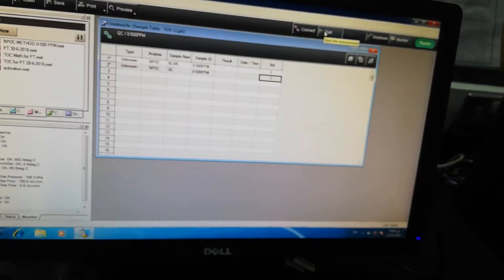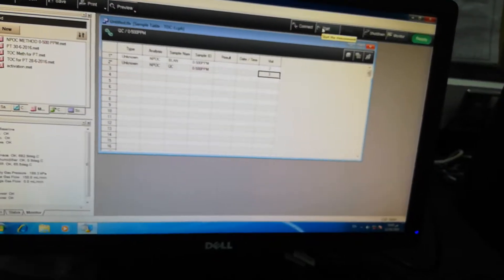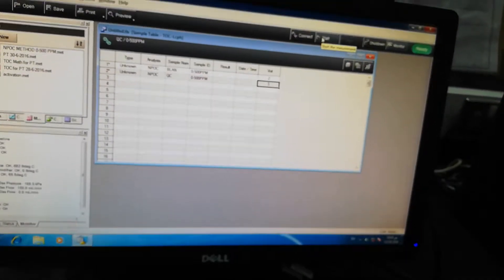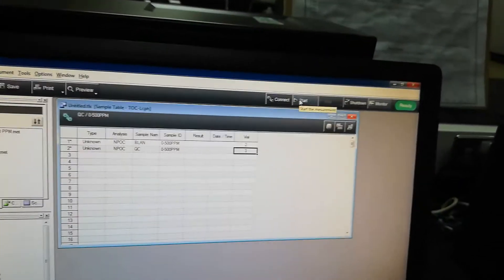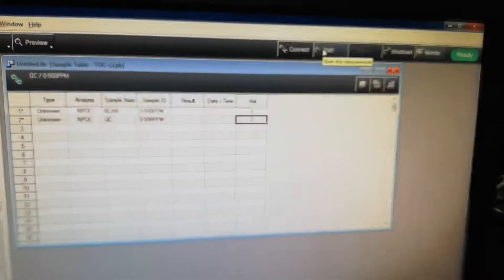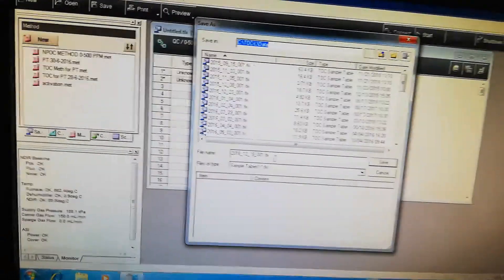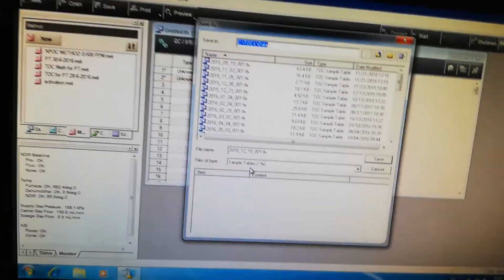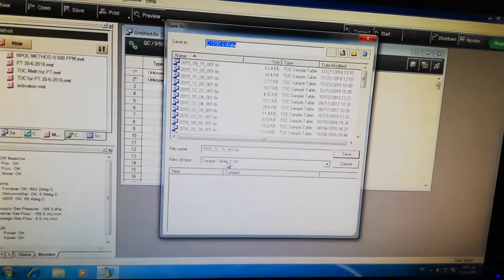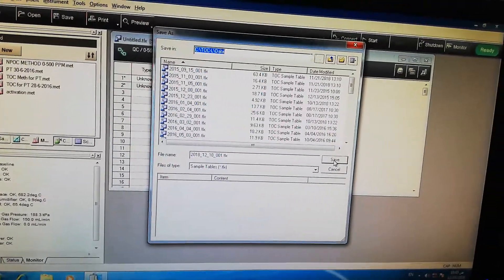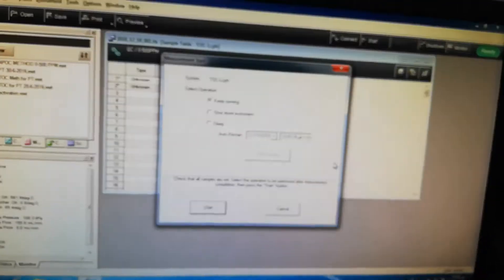Now, we only have to just start it from here. So we will just start. It will give a sign file name. If you want to give some specific file to this name, then sample table - from here you take and save it.